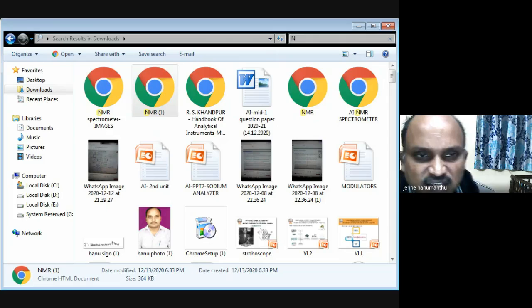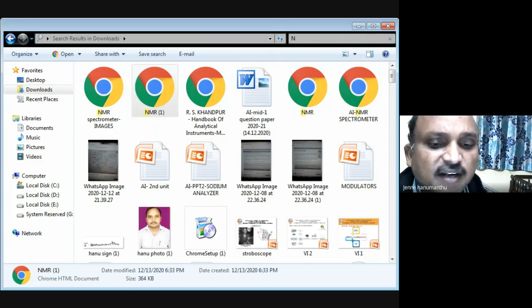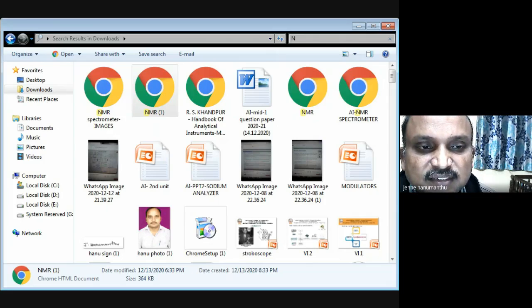See this and analyze this diagram. So this is a radio frequency transmitter. This is a magnet, an external magnet. Provided is a sample, and the sample is within the external magnet. To the sample, we apply some radio frequency through the transmitter. Fine. And this is connected to the sample. There are two connections to the radio frequency amplifier.